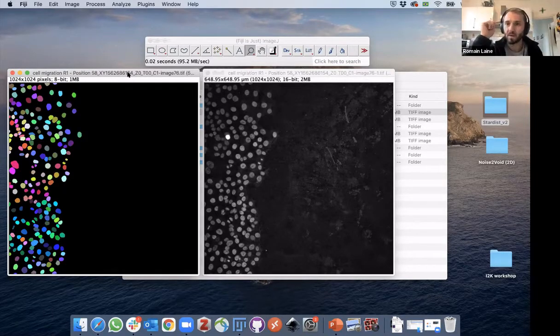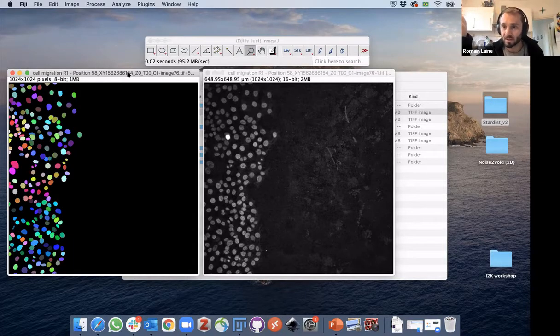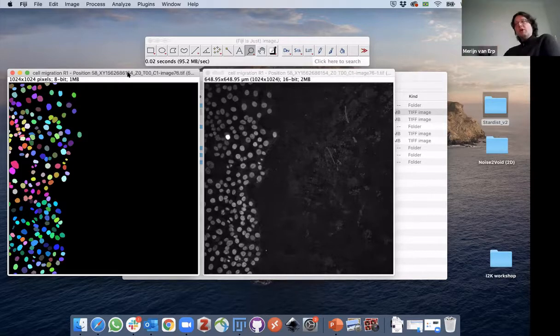No, but you explained that the labels themselves don't really matter. And in fact they disappear. The network doesn't see those numbers. It just sees objects and where they are and their shape, and tries to match the number, the places, and the shape of those objects. So underneath it kind of gets the same pixel-based classification, or is it also counting the number of objects that it expects in the image?